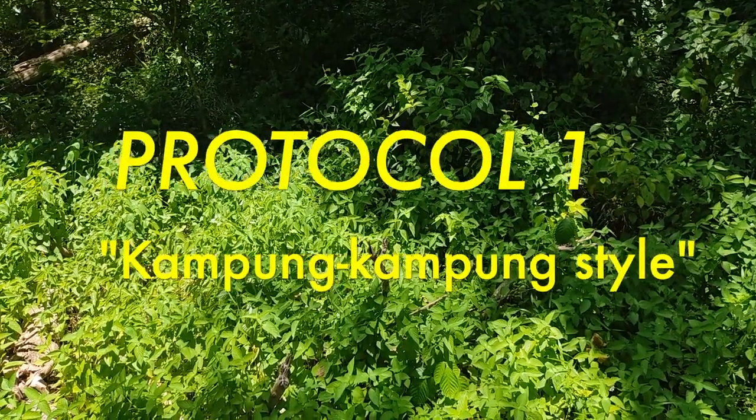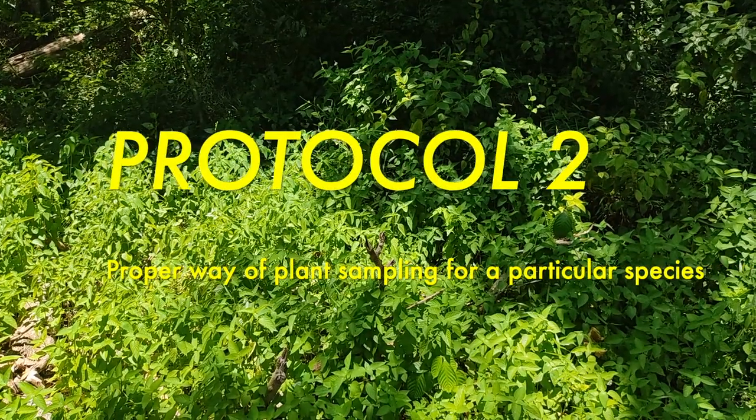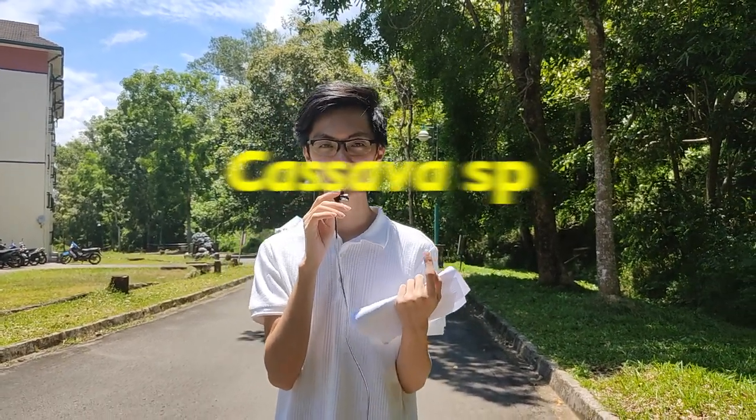Protocol 1: Kampung-kampung style. Protocol 2: Proper ways of plant sampling for a particular species. The plant species we are going to use in our plant sampling today is the cassava leaf, which is a common plant species that you can find almost anywhere.